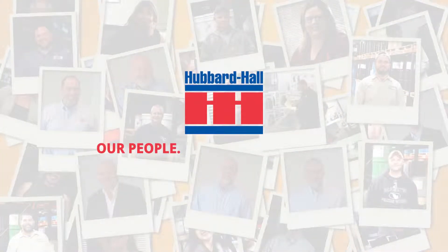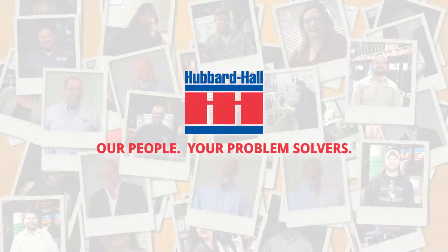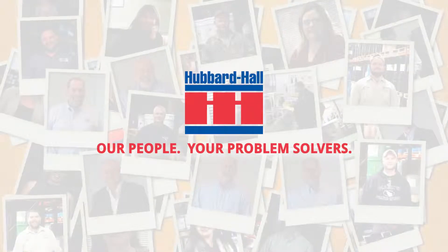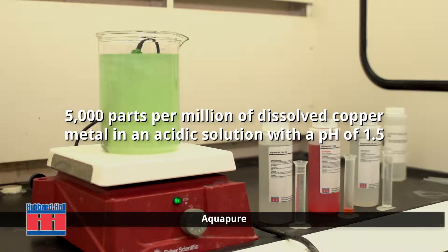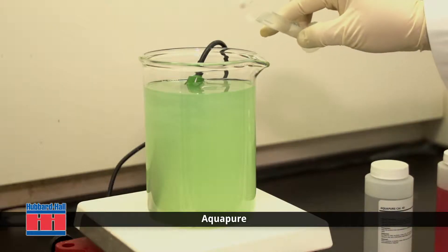Hubbard Hall — our people, your problem solvers. Here we have a typical metal finishing waste stream with 5,000 parts per million of dissolved copper metal in an acidic solution with a pH of 1.5. Treating this will require the addition of AquaPure Cal 40 coagulant.